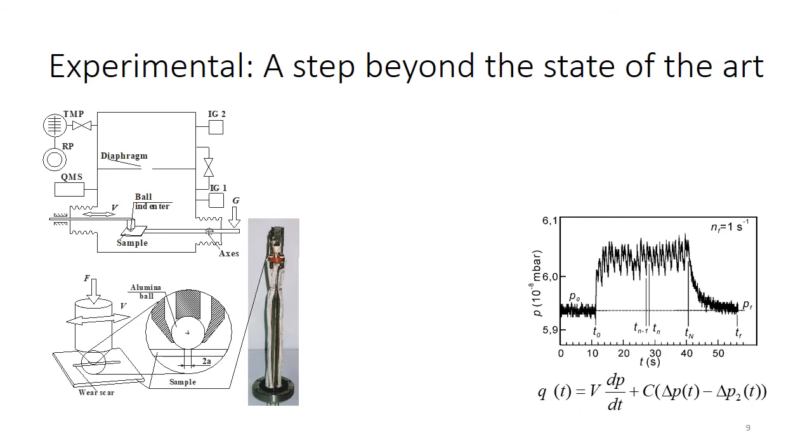So to measure the small gas emission caused by rubbing, you need an adequate experimental system, which should principally be a vacuum system, but this is not a limitation. You can also do this in atmosphere, although with less sensitivity for very small gas emission.